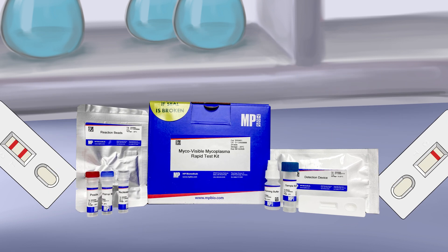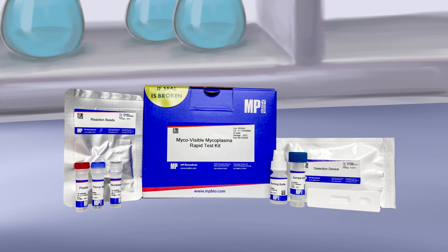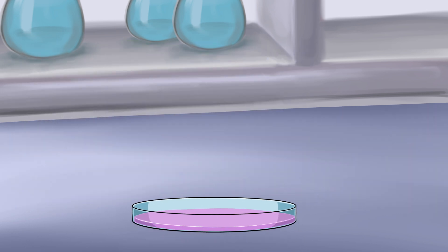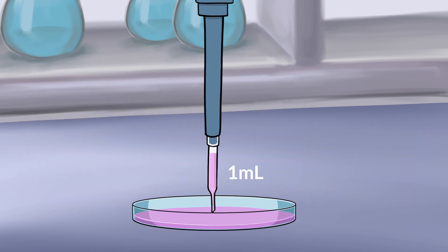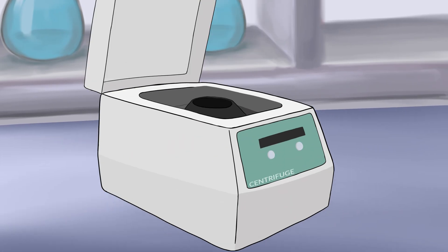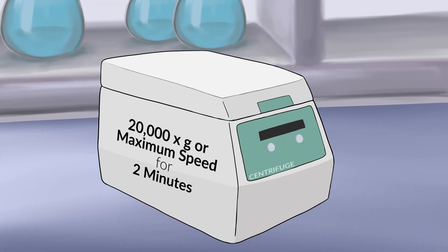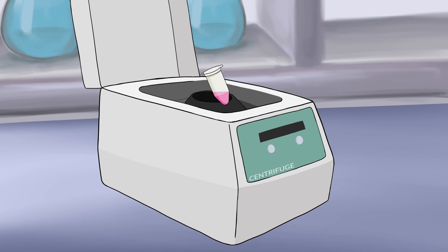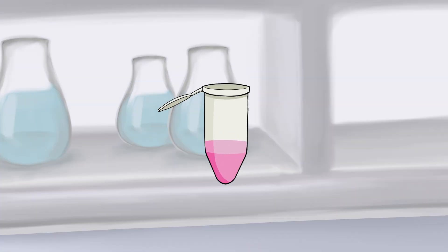To use the MycoVisible Mycoplasma Rapid Test Kit, first prepare the samples for the test. Transfer 1 milliliter of cell culture supernatant into a 1.5 milliliter microcentrifuge tube. Next, centrifuge the tube at 20,000 G or maximum speed for 2 minutes. Carefully decant the supernatant afterward.